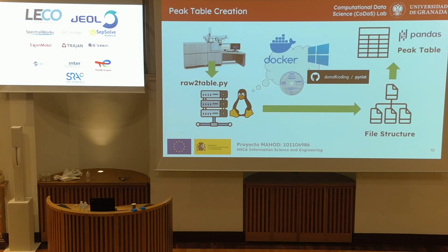And then using the power of cloud computing, you can make this as fast or slow as you want on a server of your choosing. You take the high-res TOF data, you put it on the workflow functionality, and then you can even access Windows software such as the NIST library using a Docker image. This gets output to a file structure, and then you can query that using pandas or any kind of relational database, which is all included in the software that will be available sometime. Yes, cloud computing, horrible thing.